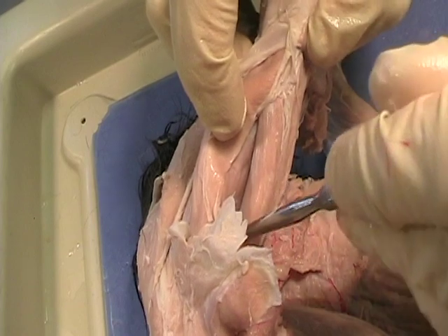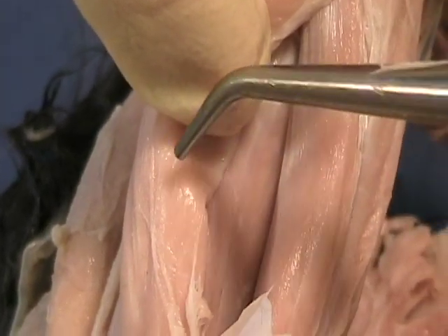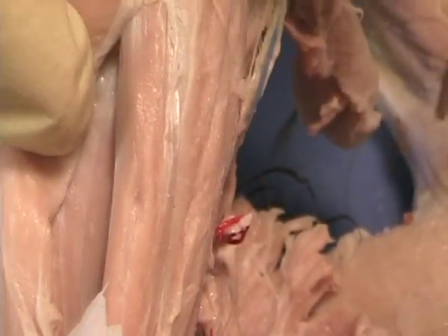Underneath the rectus femoris, there's a little tiny muscle down underneath here which is called the vastus intermedius, and it's hard to separate out, but there's a fourth quad right there. So it's like one, two, three, four — and stop.